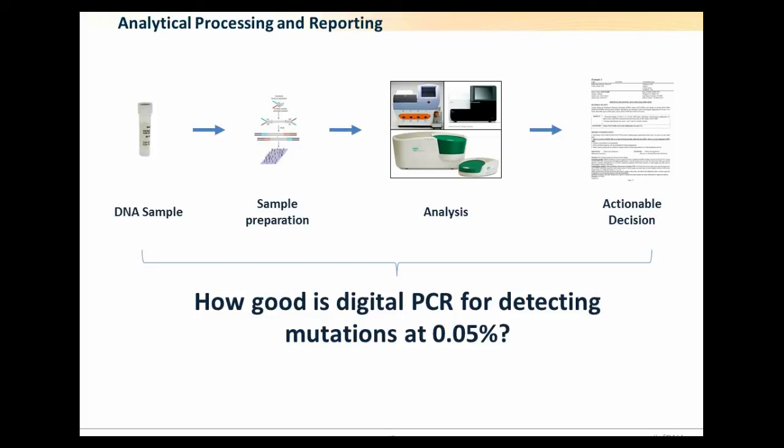So let me ask you a question. How good is your platform, if it's digital PCR or any other platform, in detecting mutations at 0.05%? Just take a second and think about it. And let's dive into some of the data that we've got.